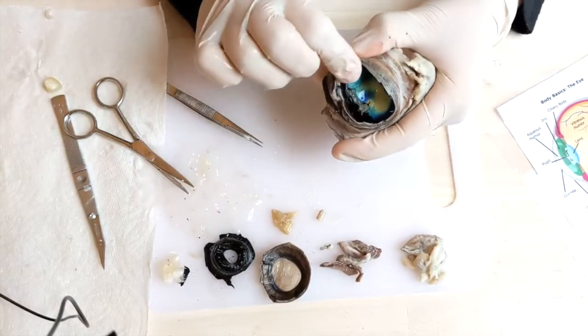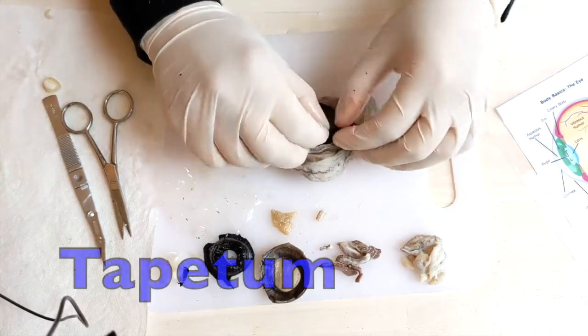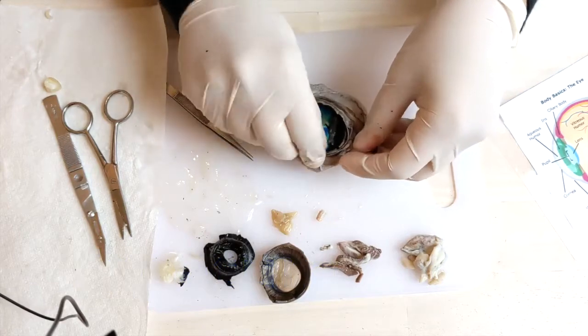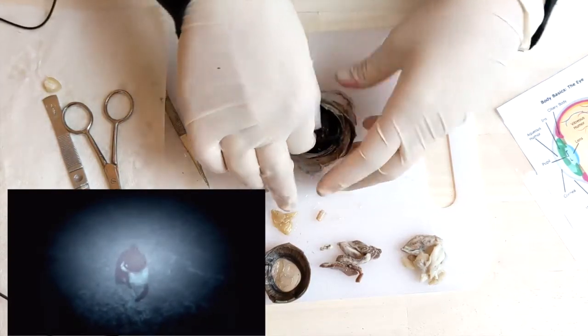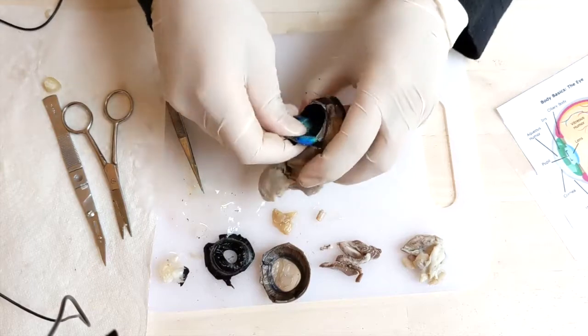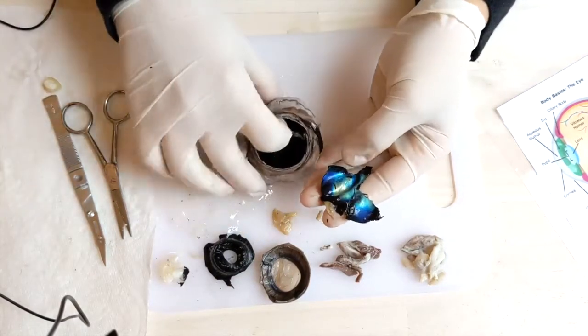Next we have this shiny part right here, and this is called the tapetum. What is it called? Tapetum. So that shiny part, usually you see it in nocturnal animals, the animals that are awake at night. Cows are nocturnal? Oh, good question, but cows are not nocturnal.